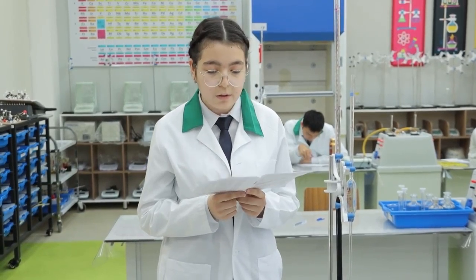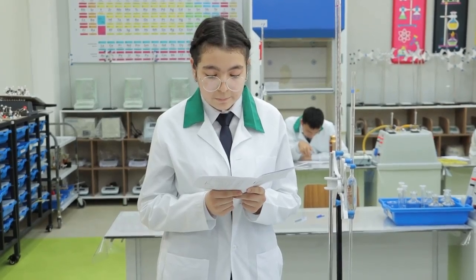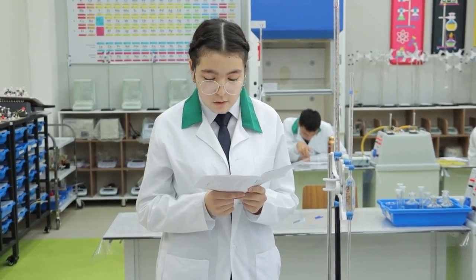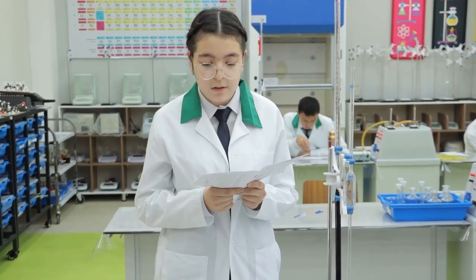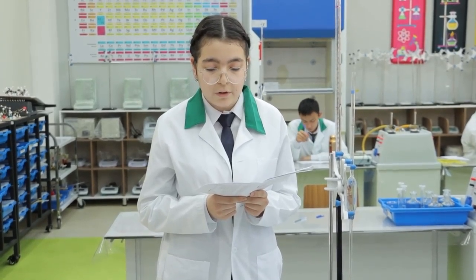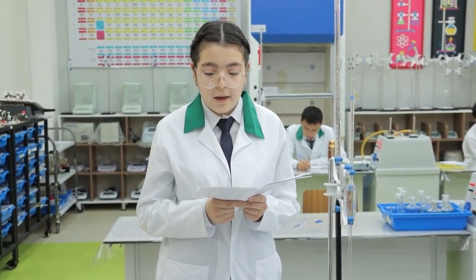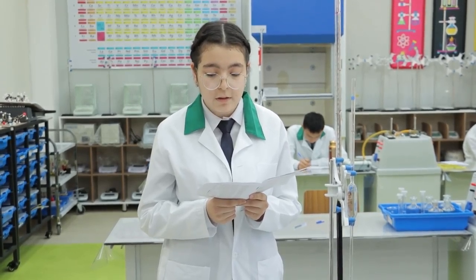And in the B part, we have taken 4 tests in order to determine the anion and cation also, and it was iron sulfate, because there was a green precipitate formed when we added ammonia, and then it turned into white PPT when we added barium nitrate.